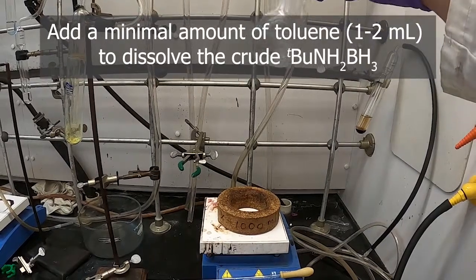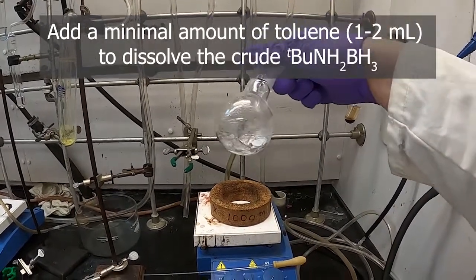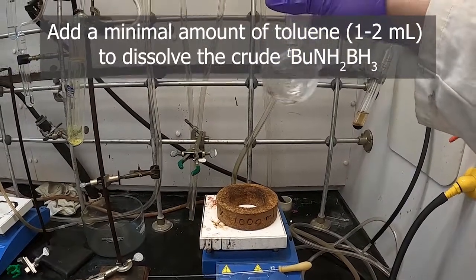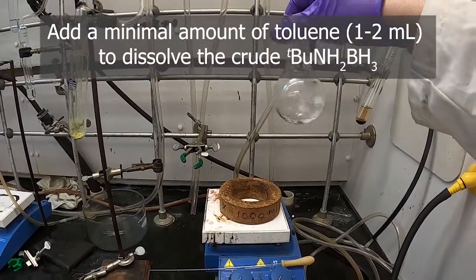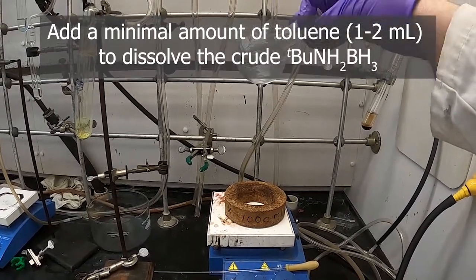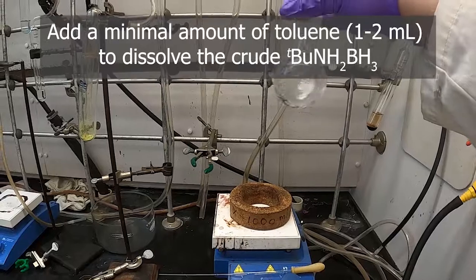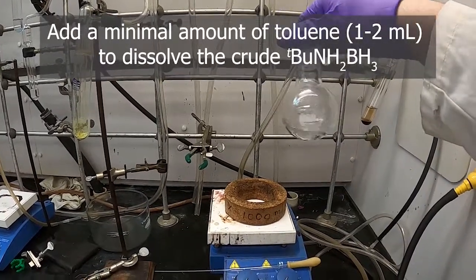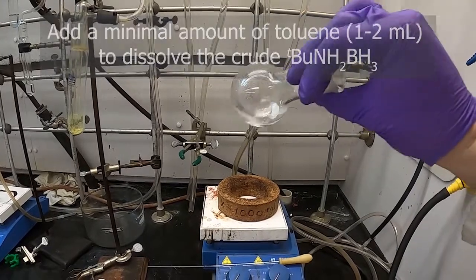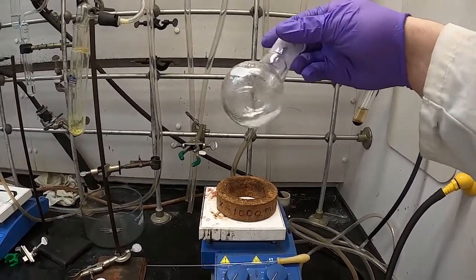And dissolve that. We'll stir around, should get it. I don't think we'll need any more toluene. If you can't get it to dissolve after a few minutes, then you could definitely use some more toluene to get that all to dissolve. Maybe we will need more toluene.